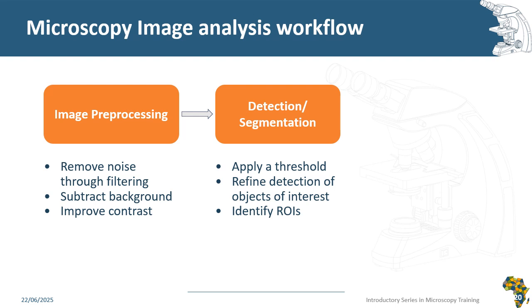Segmentation is a technical term we will use sometimes during this presentation. It means when you recognize the borders, the boundaries of the object of interest. In our case, it can be nuclei, mitochondria, vesicles, cytoskeleton, whatever biological object you want to recognize in your sample.